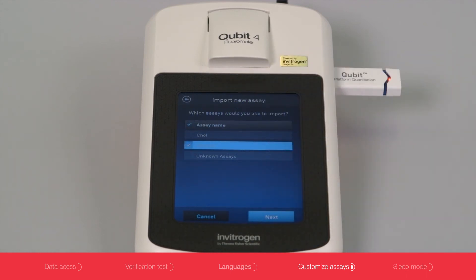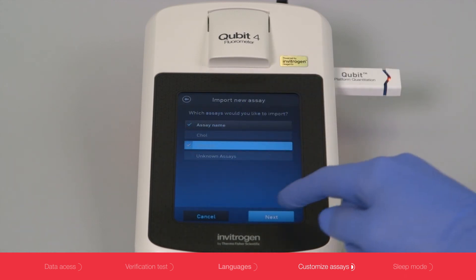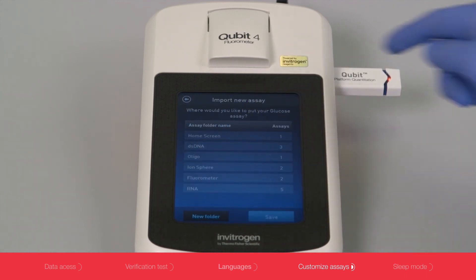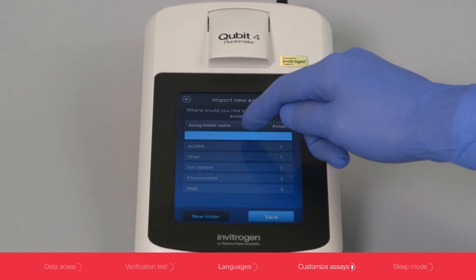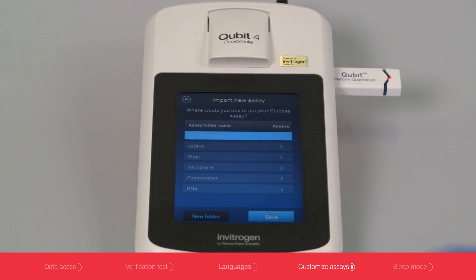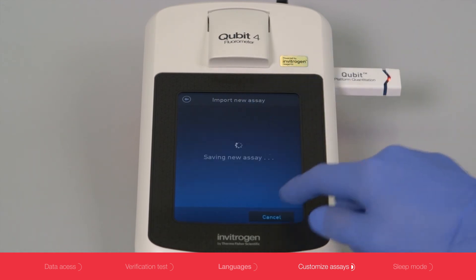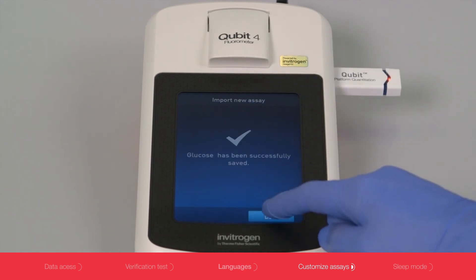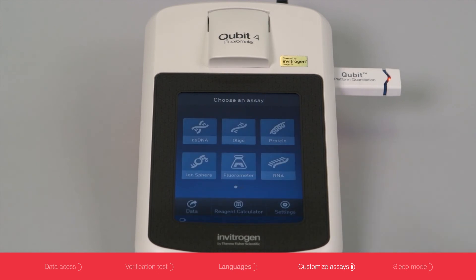After you have selected the assay you want to upload, you will need to select a location. All of the assays have the same workflow and appearance from the calibration to the graphical display.